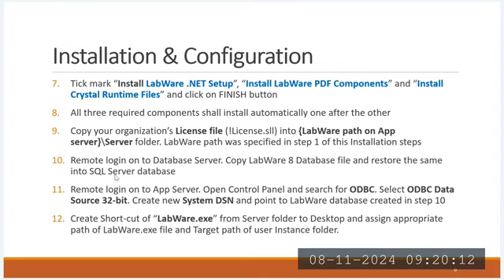with the help of the Labware LIMS application. Apart from this, there are some remote logins like database servers, application servers, and web-based servers. Those will be part of your database architecture activity. That will not be part of Labware LIMS. If you have any idea about SQL Server and SQL database activity, you will come to know.